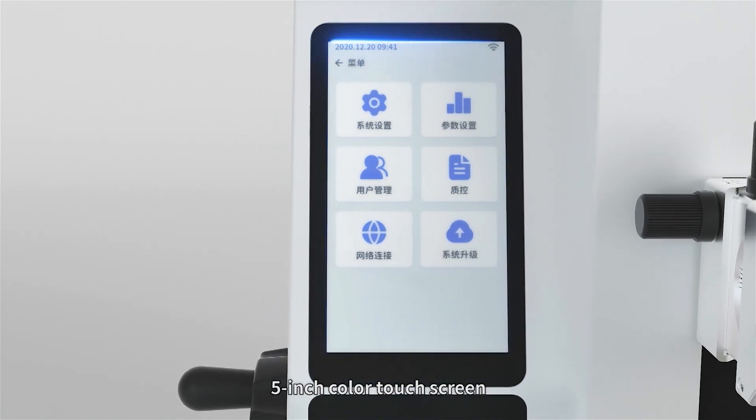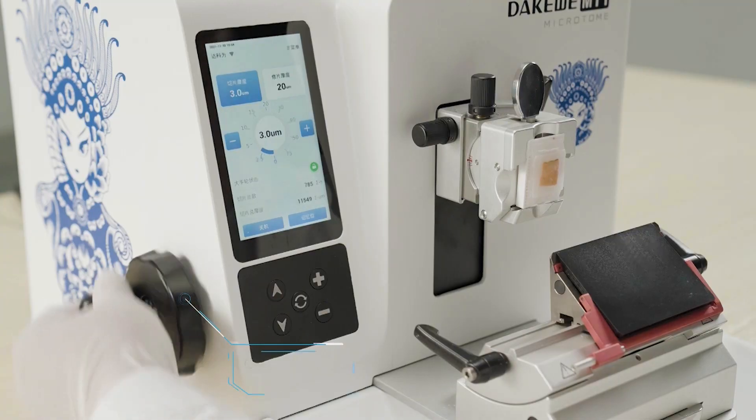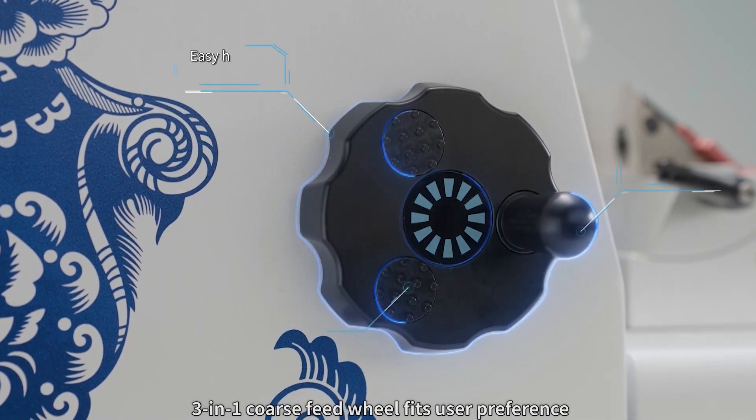A five-inch color touch screen and control panel bring intuitive operation. The three-in-one coarse feed wheel fits user preference.